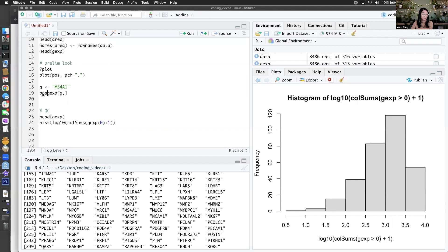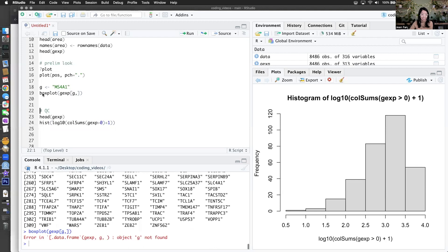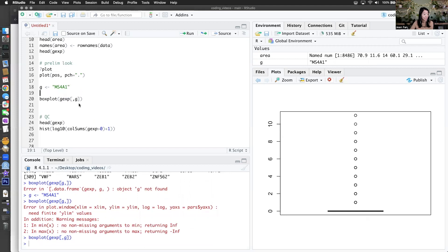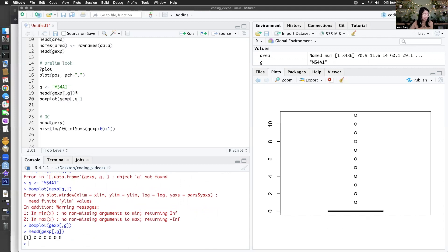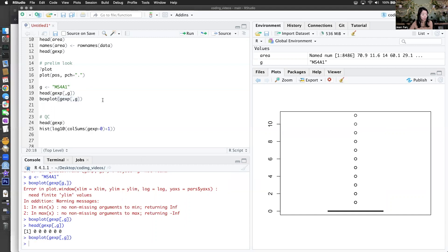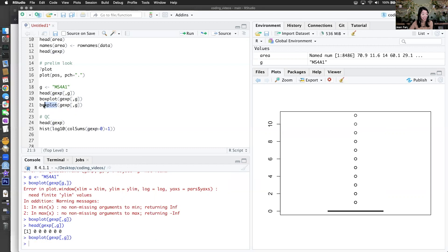Let's do a box plot. These are columns — I'm grabbing the vector that corresponds to the column for MS4A1 in the gene expression matrix. Okay, this is not a great data visualization. The class will try to come up with an explanation of why this is not good, to be able to communicate why data visualization is good and why it's not. Maybe a histogram would be better. If I log it — okay, so most cells I think don't express this gene. We have a small population that do.